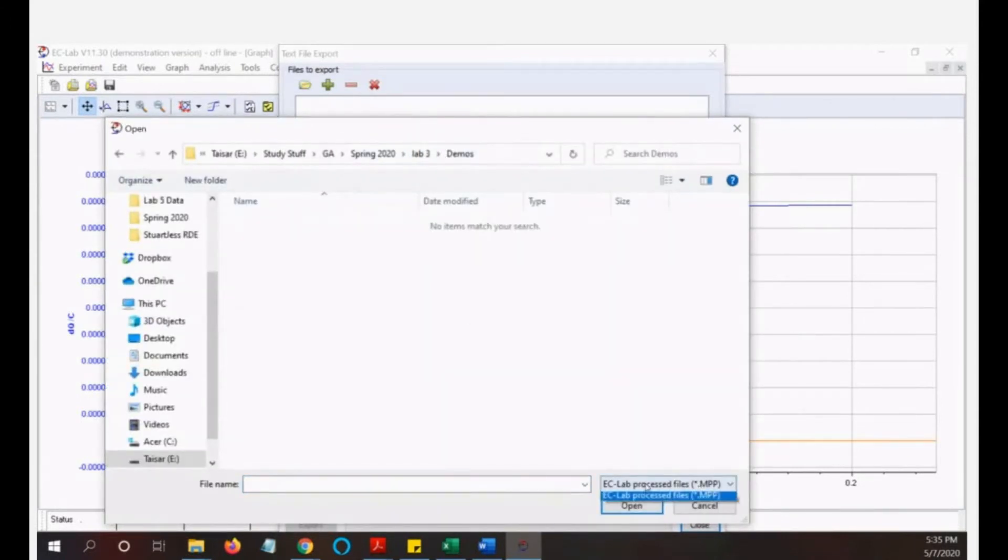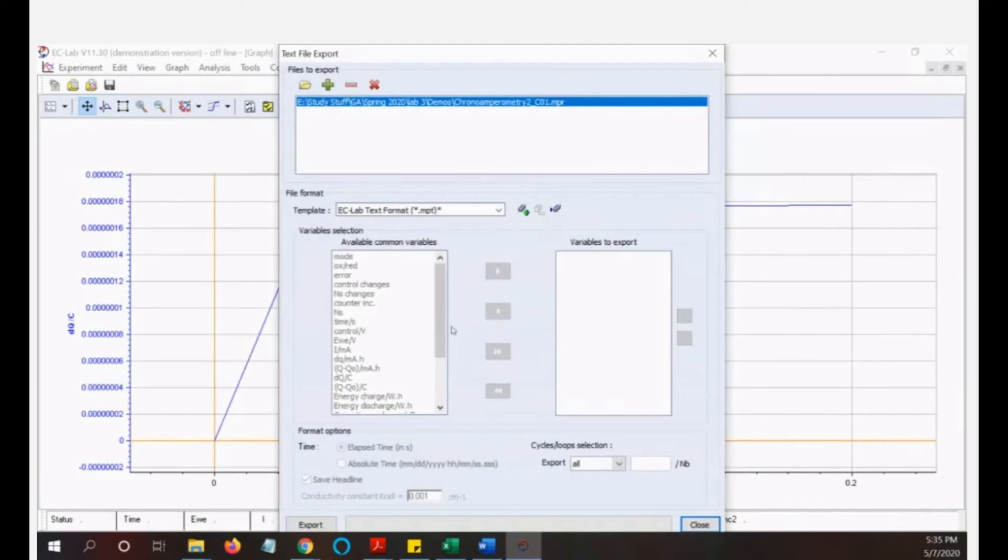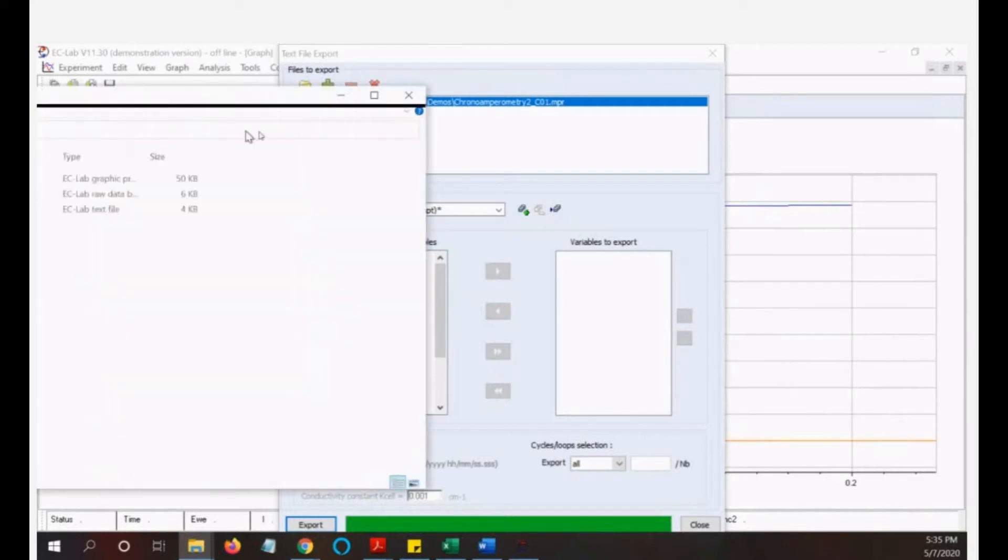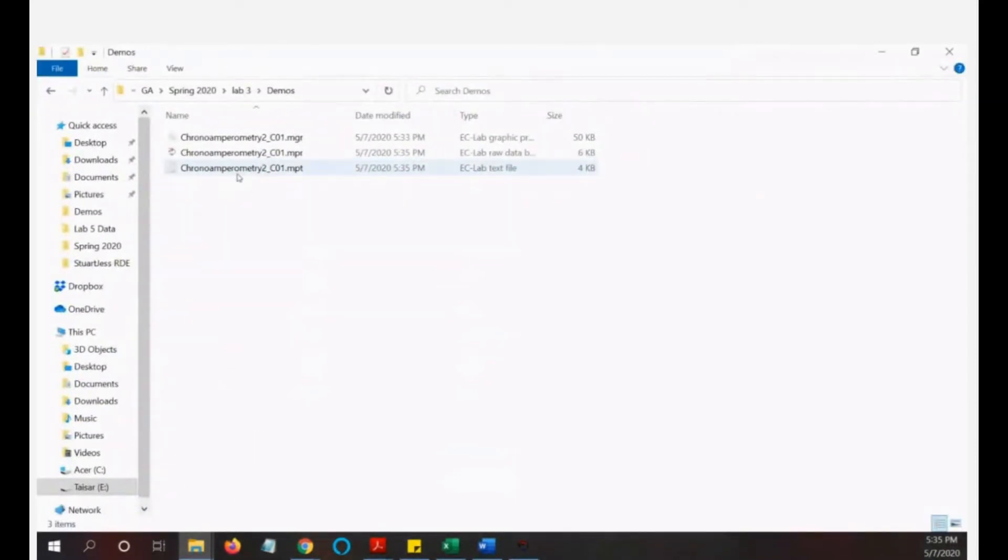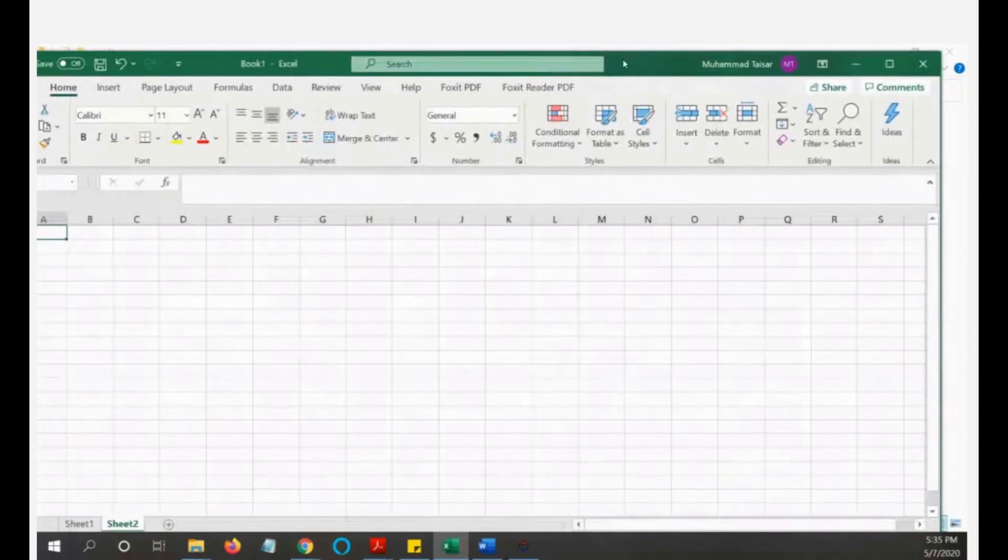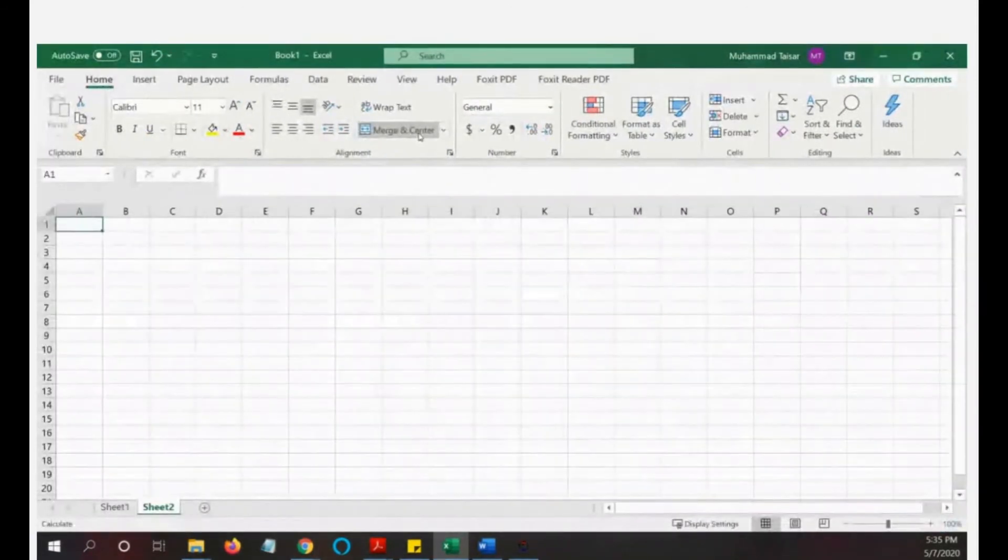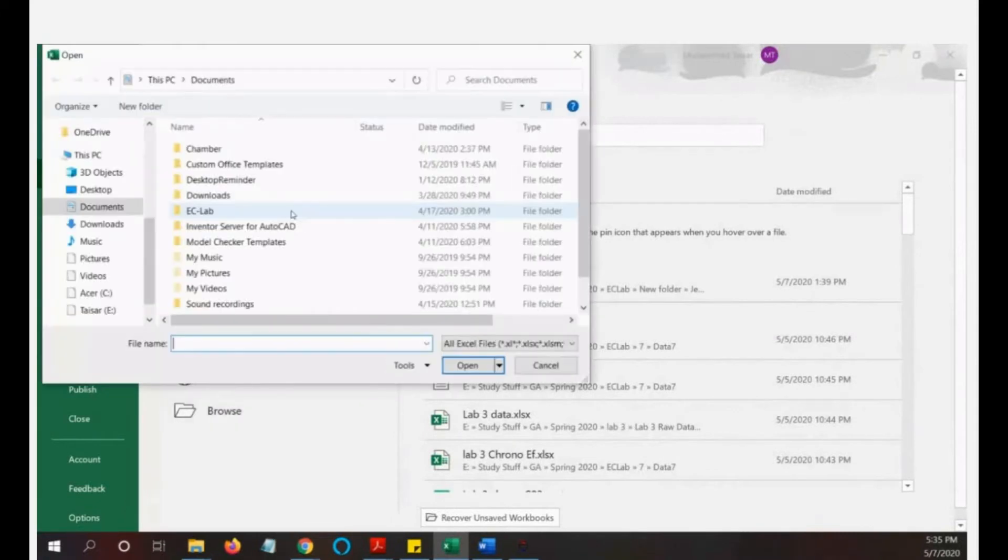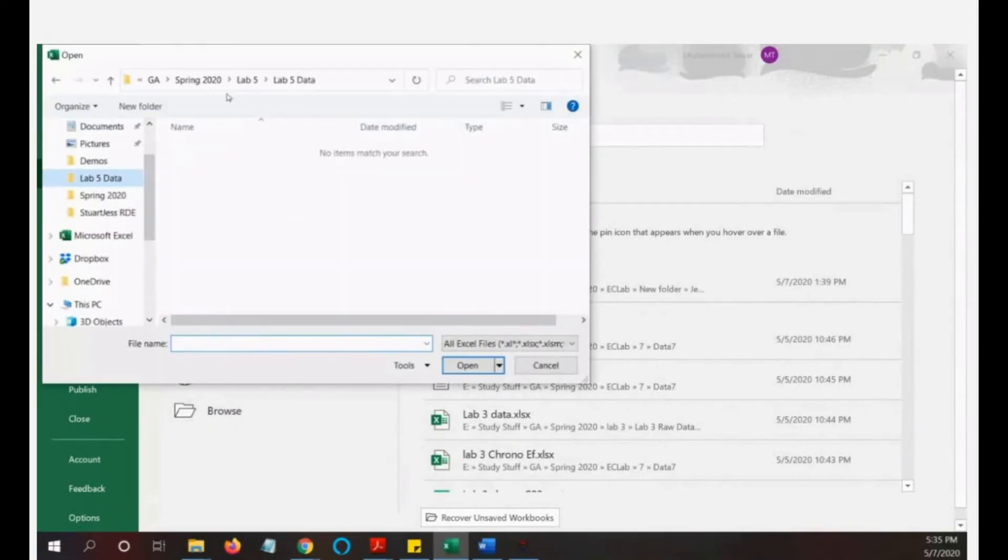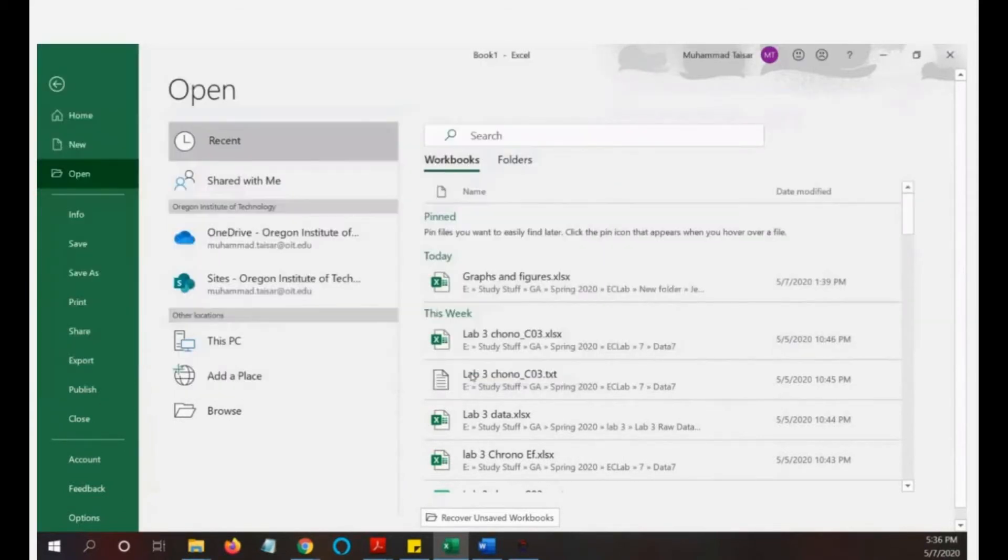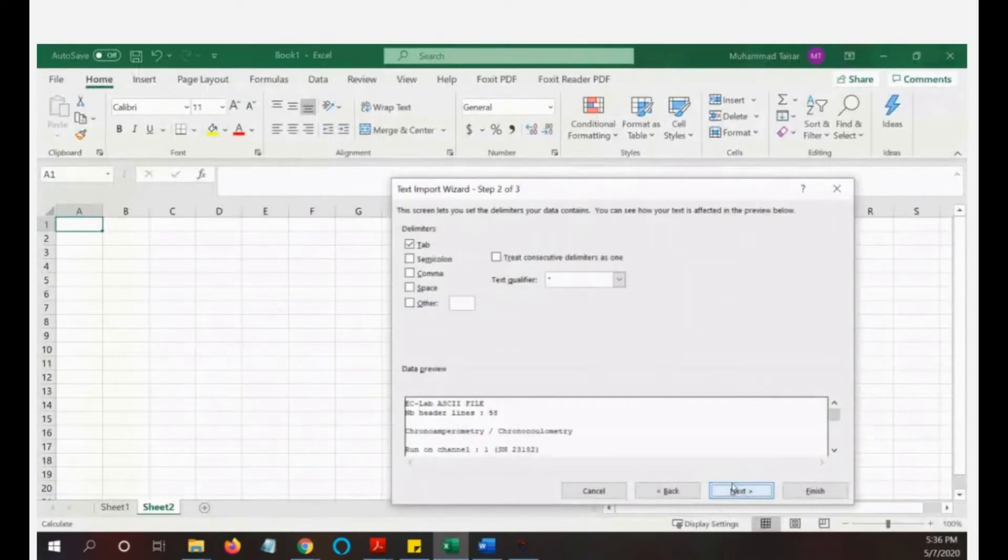As we already learned about export as text, so open that result, all files. I just export it. Then let's see in the folder. In the folder now we have that file with MPT extension and we will open this file in Excel. All files, so this is it.